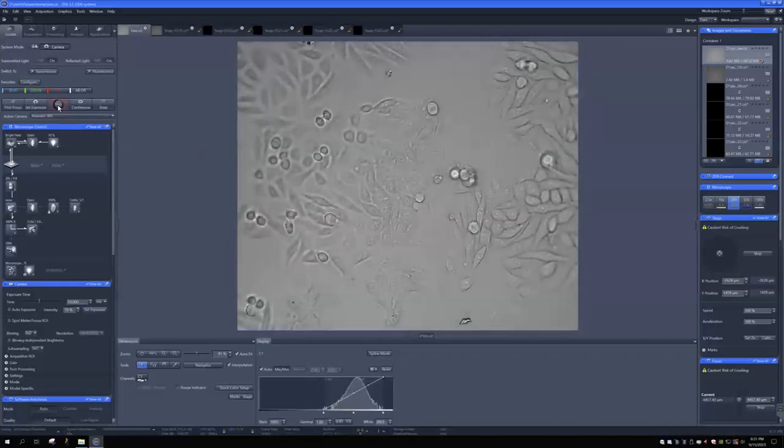We stop live imaging. Because we know that our cell is stained with TMRE, we can check if the staining is good here using the laser LED. TMRE excitation is 561, so we use 555 in this case. And then you can see here, the light is not passing through to the cells. That is because we are using a specific range of the laser, so we need to choose the reflector for it. We are using 555, which is in the red range, so we can either pick this one or this one. I'll use this one for now.